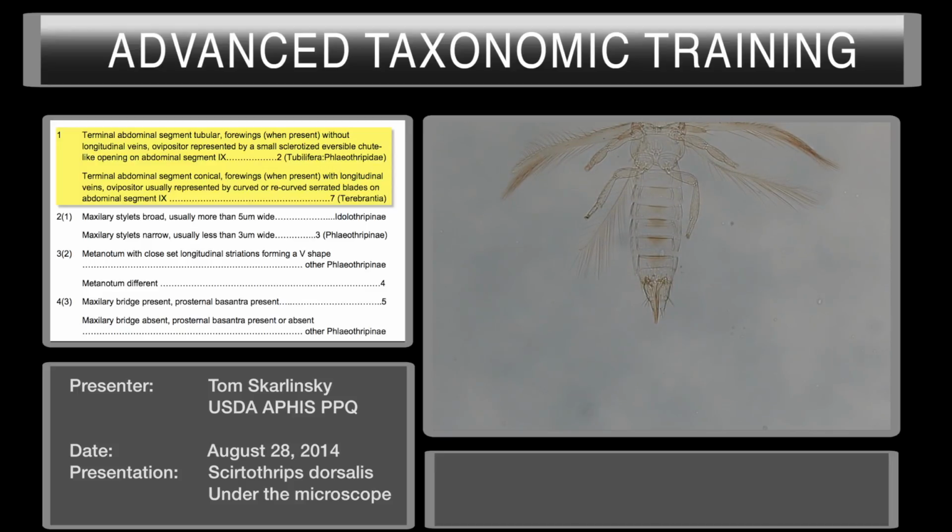Well, right there in that area. Is it tubular or conical? I think we would all agree that it's conical. It's not tubular. You can see the sides are kind of narrowed. It's like an upside down cone.